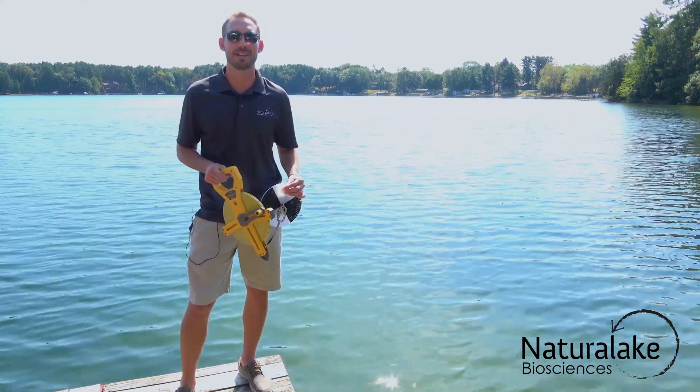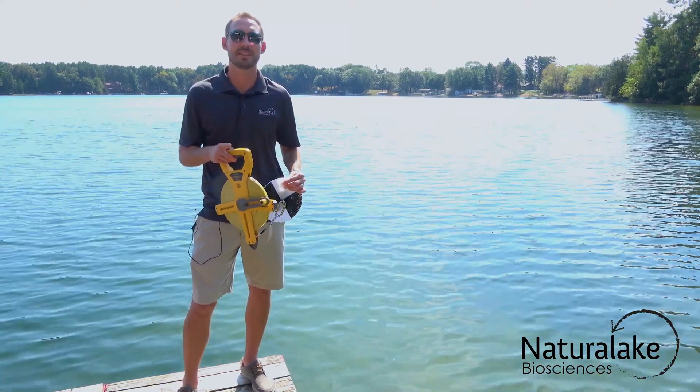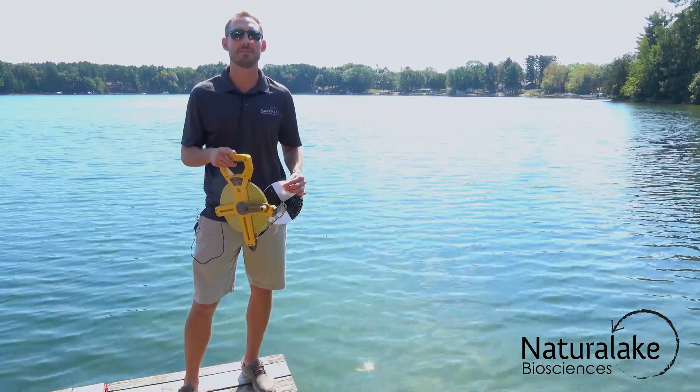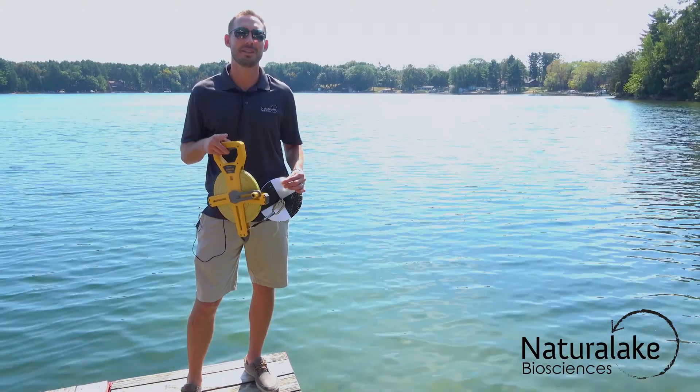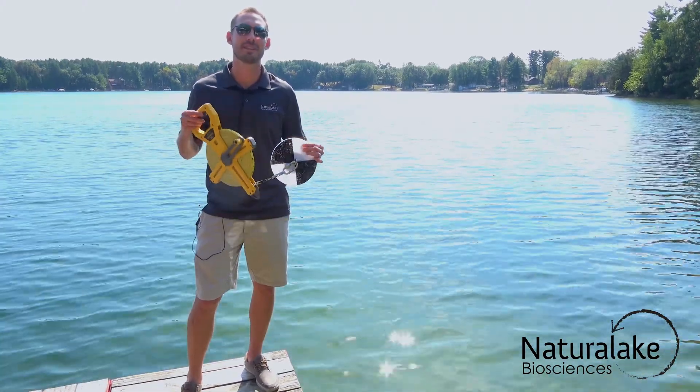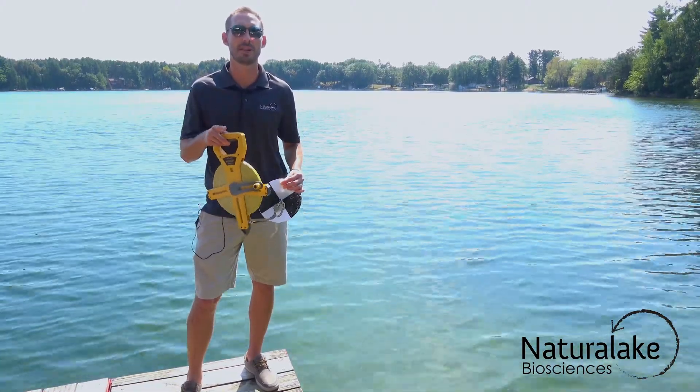Hey, it's Landon with Natural Lake Biosciences. Our team of scientists is out in the lake right now doing some research and collecting data, so I'm going to stay here and show the DIY scientists how to use a Secchi disk to monitor water transparency.